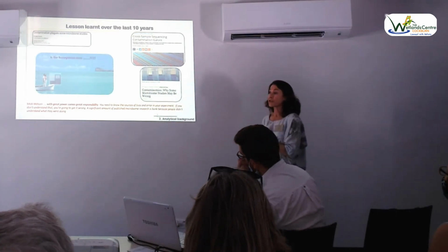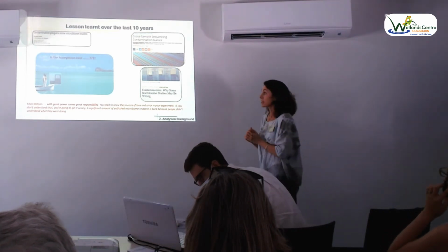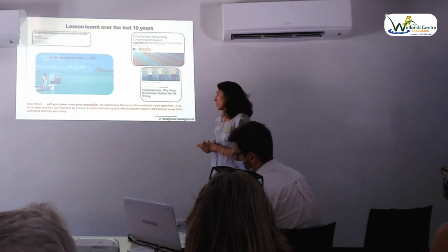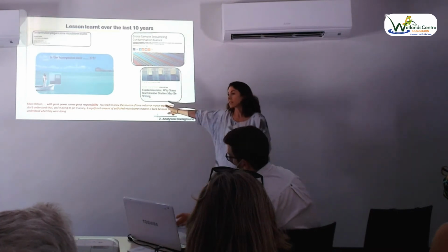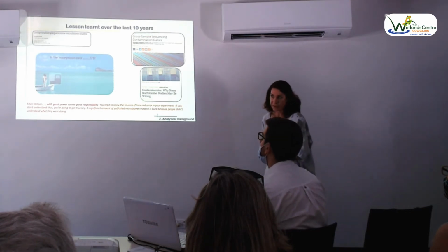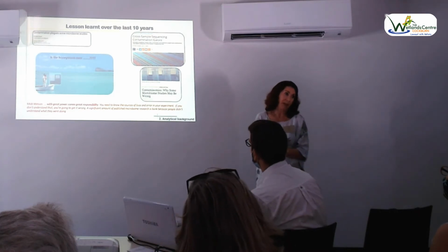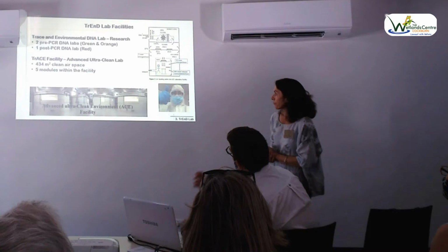So it's really stringent now when doing environmental DNA work and high throughput sequencing work. Mick Watson, who works in the microbiome, said you need to know where your sources of bias and error are in your experiment. Otherwise, you're going to be interpreting results which you think may be your results, but it may also be contamination, whether that's come from the field or in the lab.